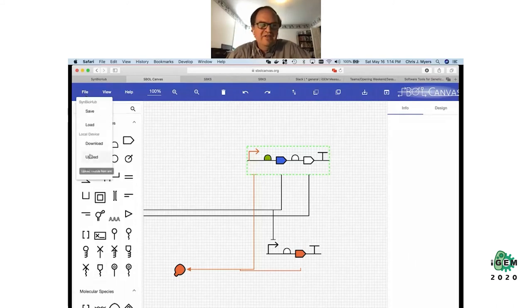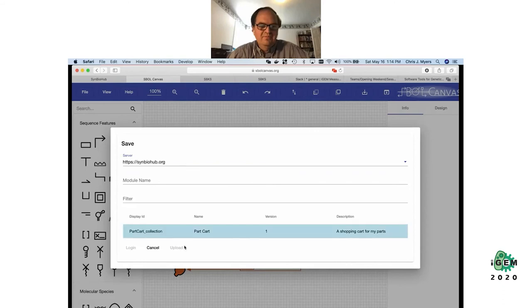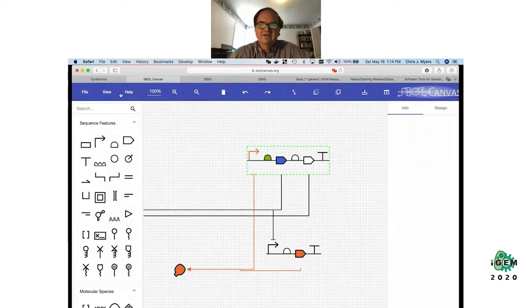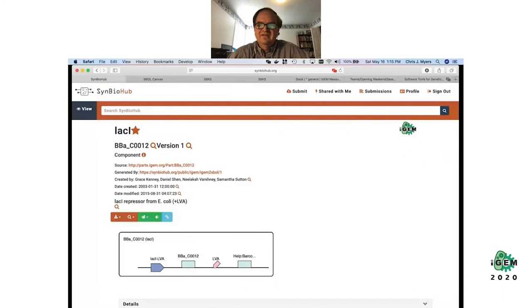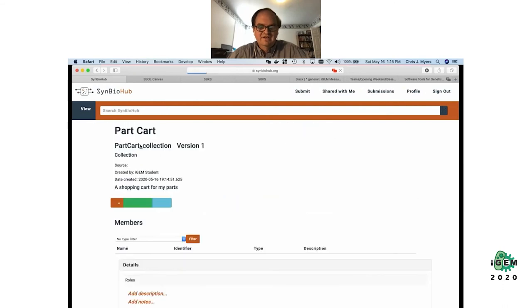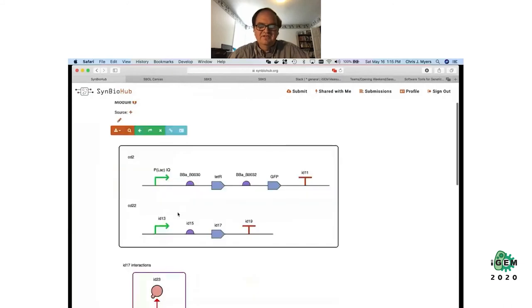You get the idea — you can carry on and fill in the rest of the parts, and when you're all done you can save this back to SynBioHub. You can put it back into your part collection and give it a name. If you go back to SynBioHub and go into your part collection, you'll find the toggle switch you built. If you're curious about a specific part like GFP, you can click on it and it'll take you to the page about that GFP part in your design.